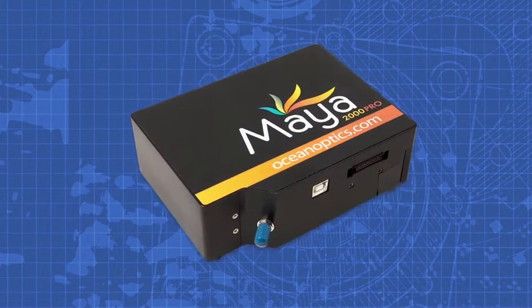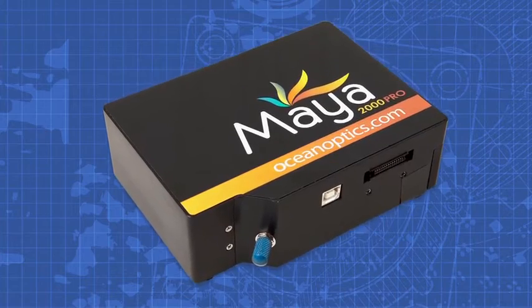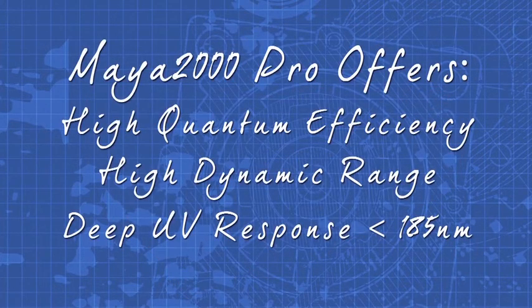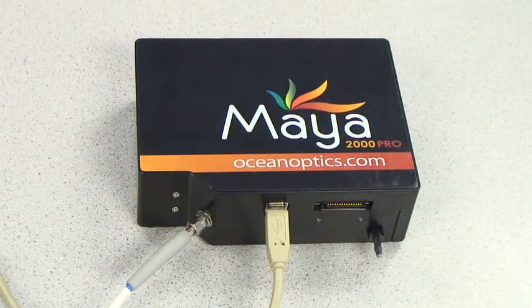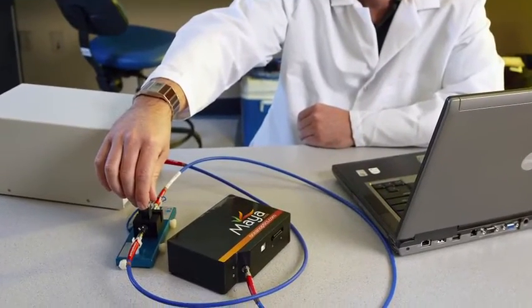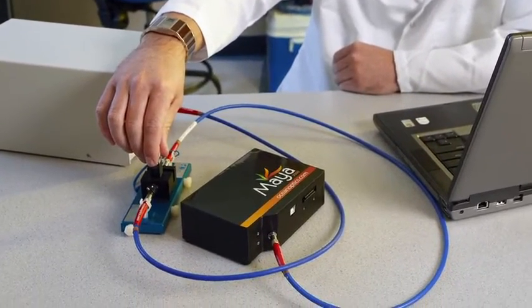The Maya 2000 Pro is the ideal deep UV spectrometer for motion optics. It offers high quantum efficiency and high dynamic range, and is responsive in the deep UV down to 185 nanometers and below. The Maya 2000 Pro delivers serious performance — its Hamamatsu detector is perfect for applications that require higher quantum efficiency over a broader spectral range.